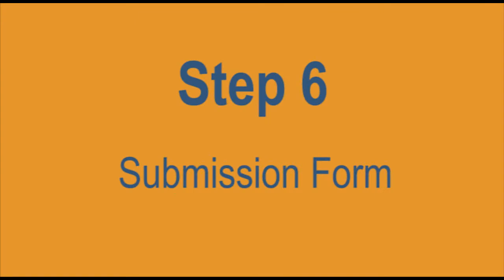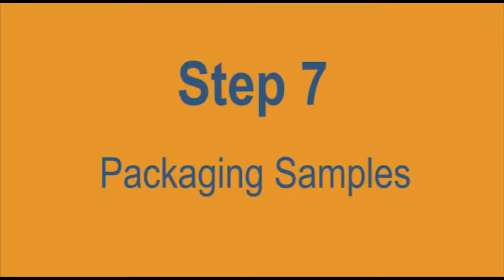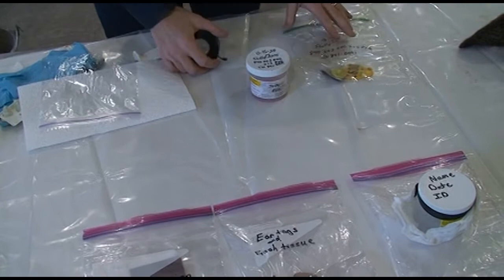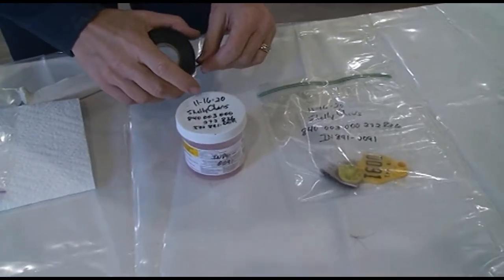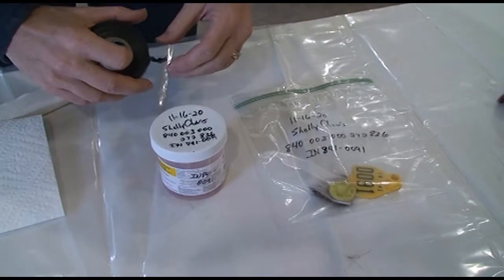Step 6, Submission Form. Make a copy for your records. Submit form with samples. Step 7, Packaging samples. Next, we're going to talk about packaging the samples to be able to submit them to the diagnostic lab. And so here's the samples we just took, and you've got your name, date, and the identification, the IDs from the ear tags. And we've got our formalin jar and our fresh tissue.